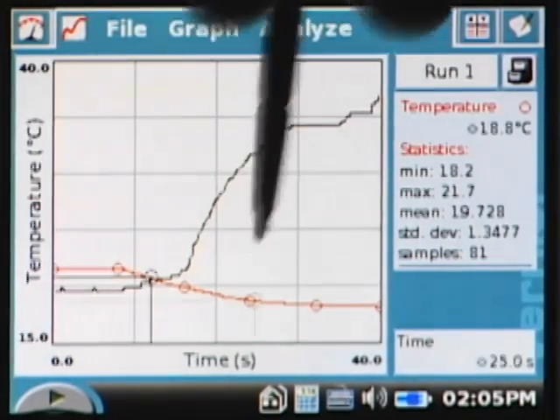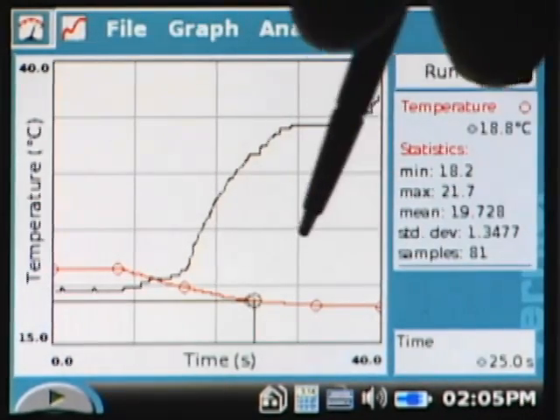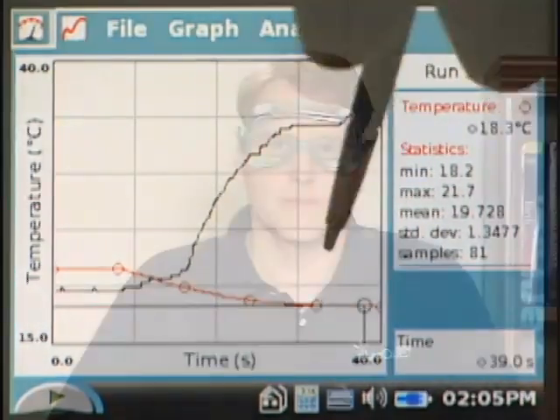In this lab we've covered some concepts that are kind of interesting. We've done some temperature change with the temperature sensor while doing a chemical reaction, so we had the vinegar and the baking soda, and as we added those two things together, we saw a temperature change. If you're interested in doing this lab, you can download it for free from the Vernier website and give it a try.